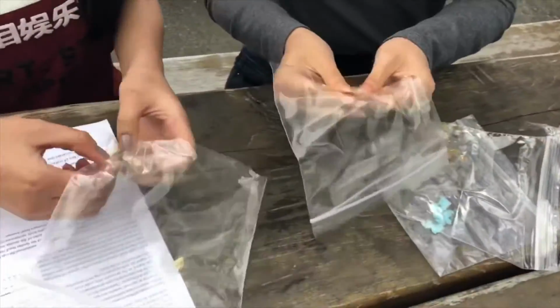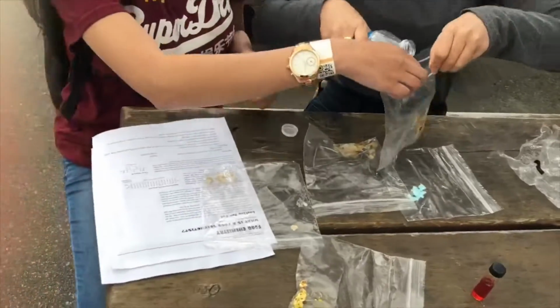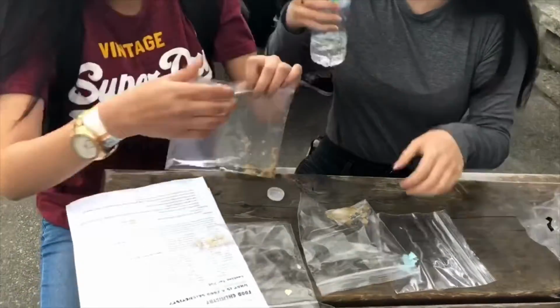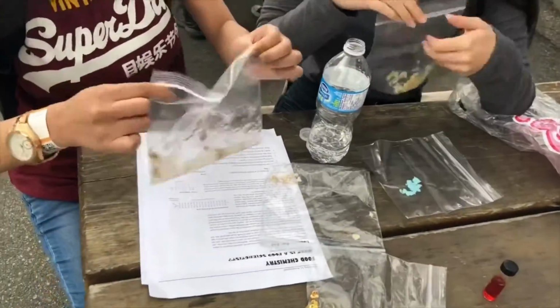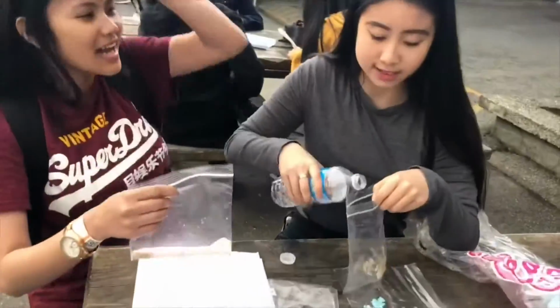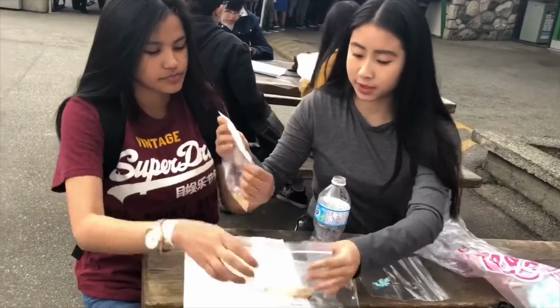In this experiment, the materials we used were the Sudan stain in a plastic dropper bottle, 5 plastic bags, water, and 5 different food samples. The 5 different food samples we tested were the hamburger patty, cotton candy, popcorn, bread, and fries.